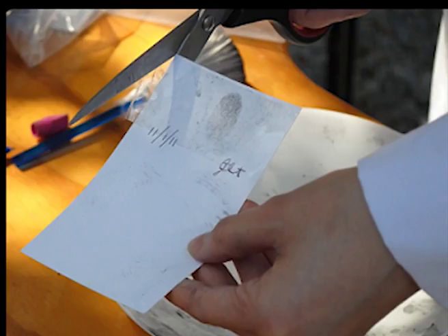Iodine fuming is a sensitive method for developing latent fingerprints on porous surfaces, such as paper and paper products. The other reliable method for porous surfaces is the ninhydrin technique. However, good results are obtained by ninhydrin only after the developed fingerprints are treated with metal salts, followed by laser action or laser examination. No such costly equipment is required with iodine. Iodine fuming develops both fresh and relatively old prints.